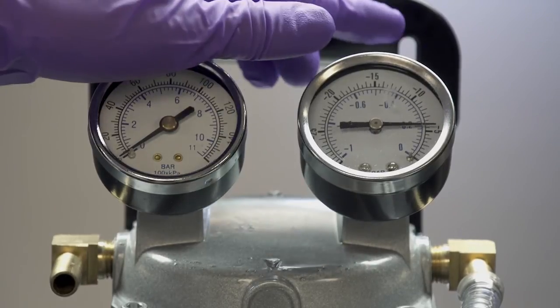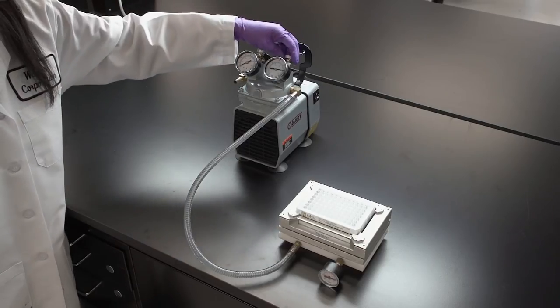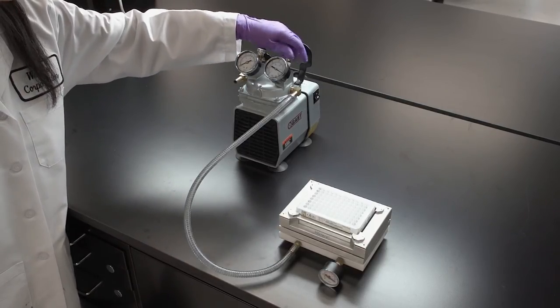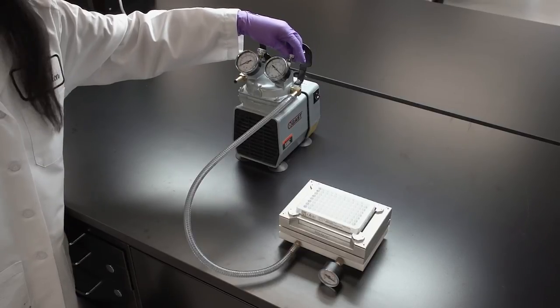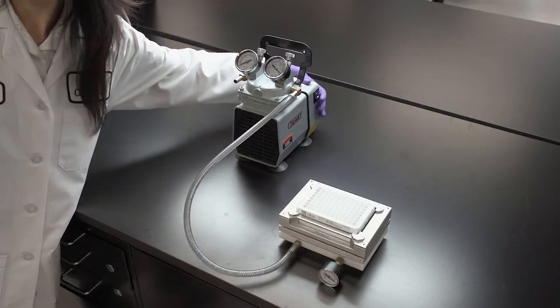You may need to increase vacuum momentarily to ensure all wells are completely drained. Once all the liquid has been drawn through the plate, adjust vacuum to zero and turn off the vacuum pump.